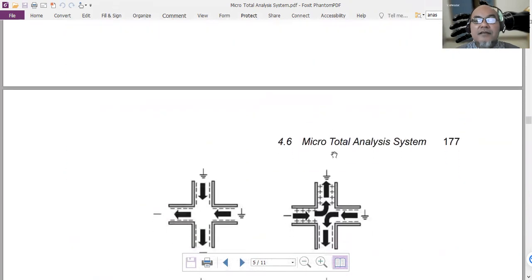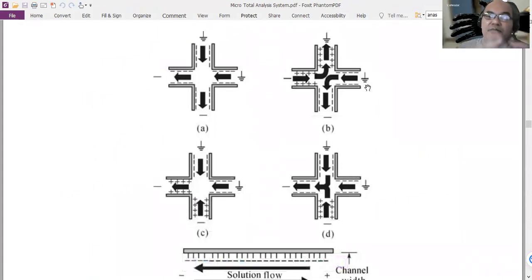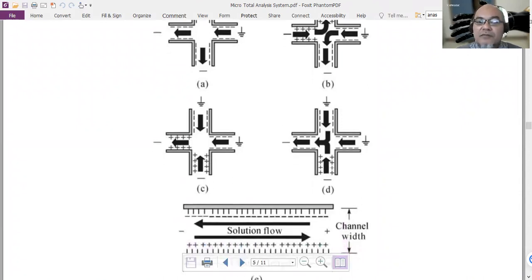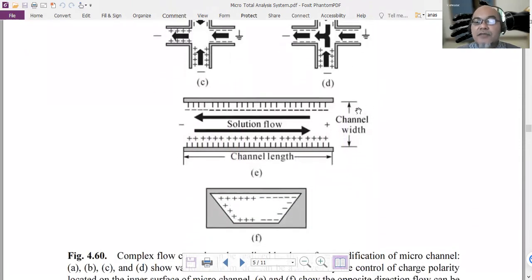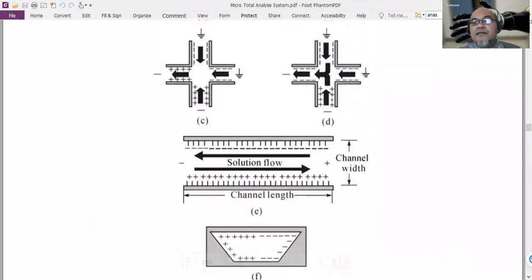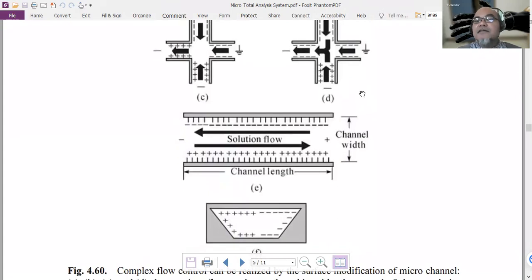So the problem is that with laminar flow, it is very difficult to have a mix between different flows. For example, like this, they cannot mix because it is laminar flow. That's why in order for them to mix, you have to use special techniques, various techniques like using what we call an electrostatic mixer. You can also use a chaotic mixer and many different kinds of techniques.